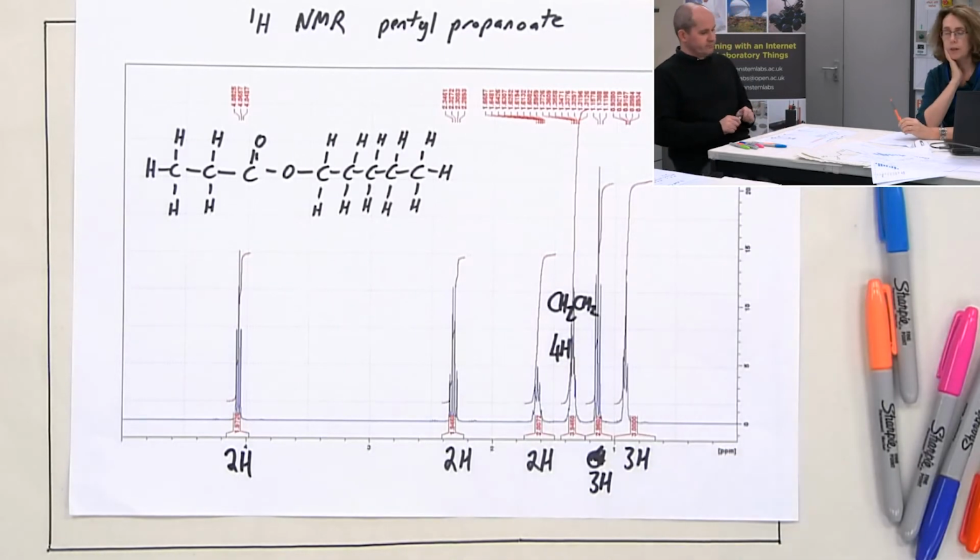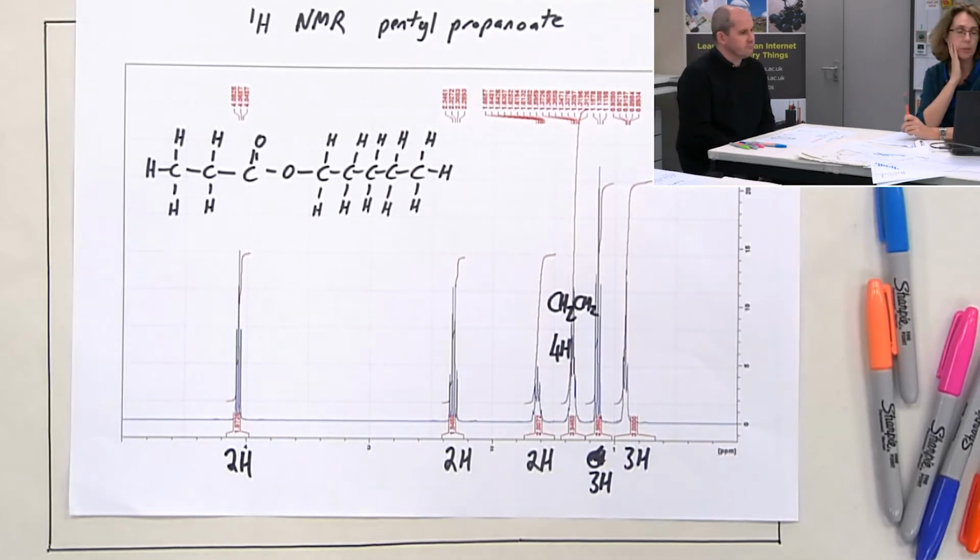It does, and I think also, because this is related to the question we had before, which was why in the previous example you'd said that there were 5 aromatic protons that were chemically equivalent. Now they weren't chemically equivalent, there were actually 3 of those aromatic environments, but the chemical shifts for those were very similar, so the peaks tended to overlap. Even though they were in 3 different environments, the chemical shifts were very similar. So it's the same principle that we've seen here.